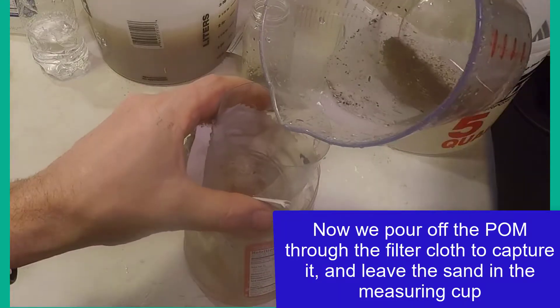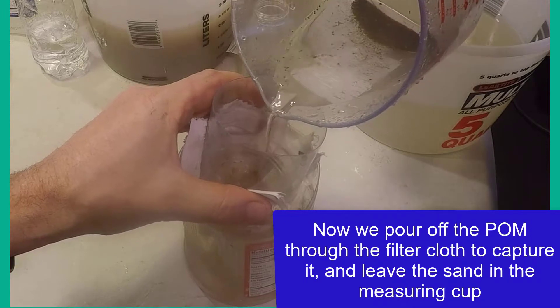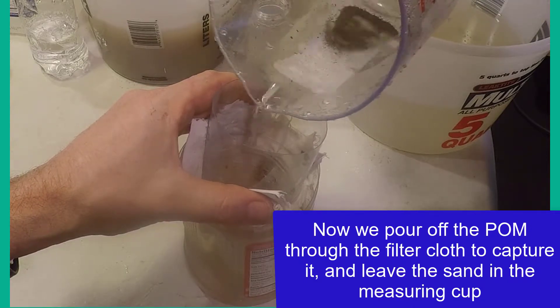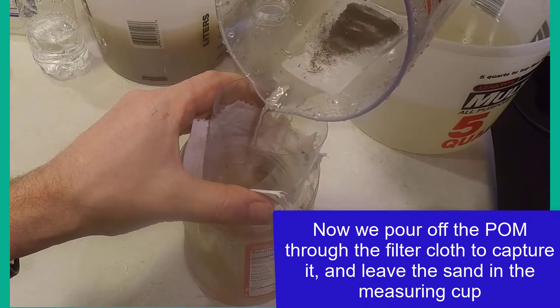The next step is to pour off or decant the organic matter that is floating in the water into the simple cloth filter. Start with the material that is obviously floating.